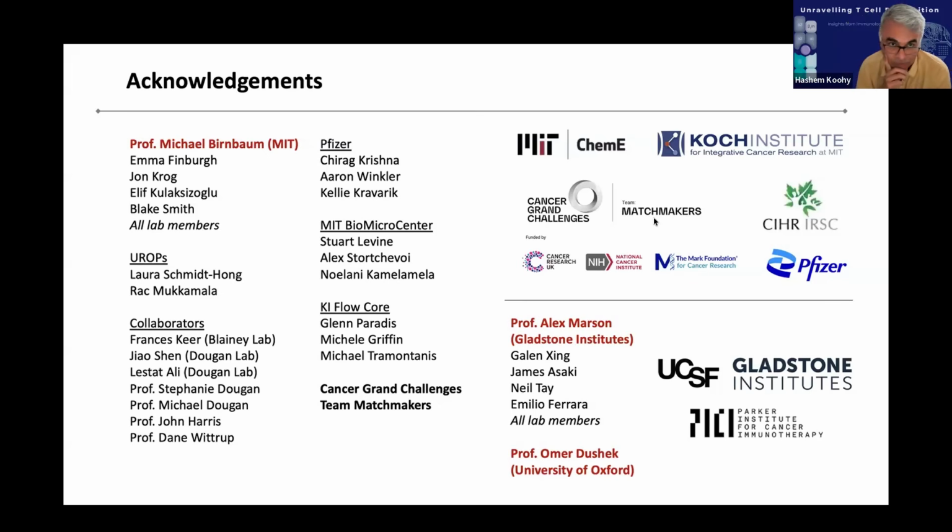It's a great question, actually. Interesting. I think Jurkats are inherently limited just in and of themselves. That is my view. And so I think that as far as showing functionality of a TCR, whether it's via CD69 or NFAT, the real reason we used NFAT here, having tested both, is that NFAT is more sensitive, just much more sensitive, having that fluorescent reporter. There does seem to be some baseline CD69 in Jurkats that you can get enrichment, very nice enrichment, but if you really want that extreme sensitivity, the NFAT reporter really does do a phenomenal job.